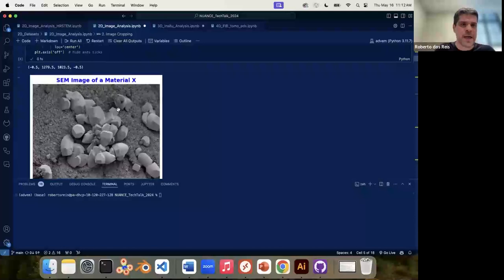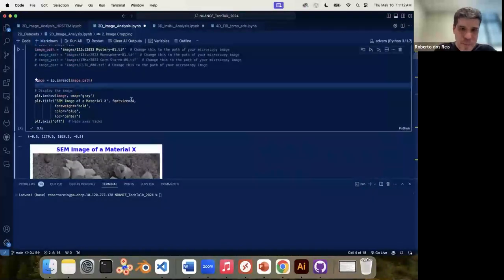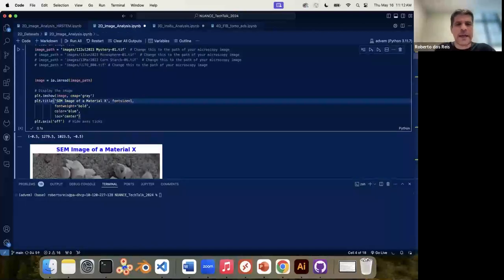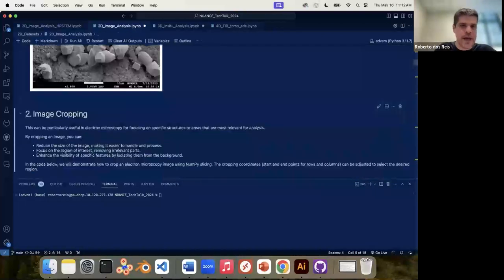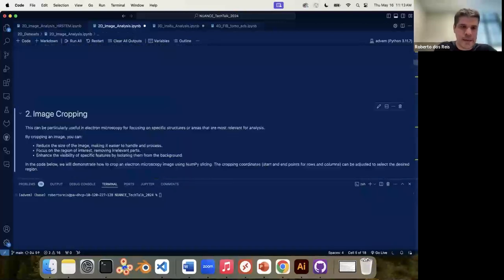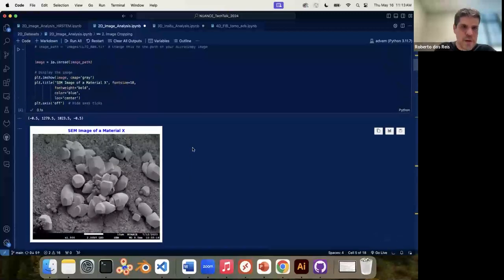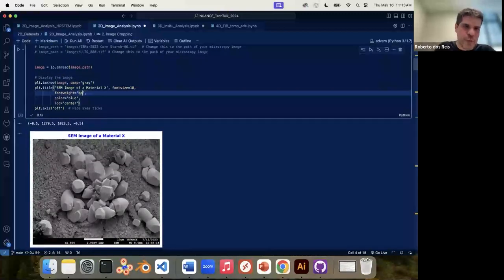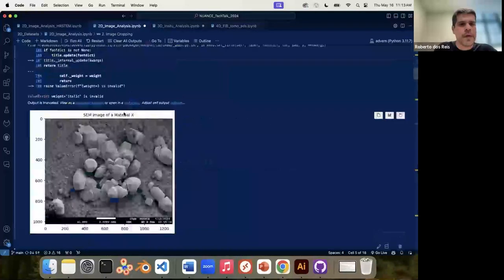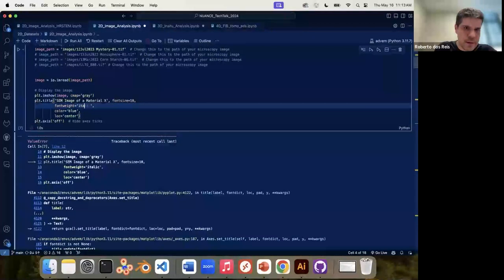A quick thing that you can do is turn off the axis and then plot that. That looks better, right? You can do a quick change of the title, for example, change the font size. I don't want it like that, it looks too big for me. I just do 8, and that's too small. Maybe 10. Let me just show that. And you can change from bold to italic, for example. And then have an italic, which seems to be broken.